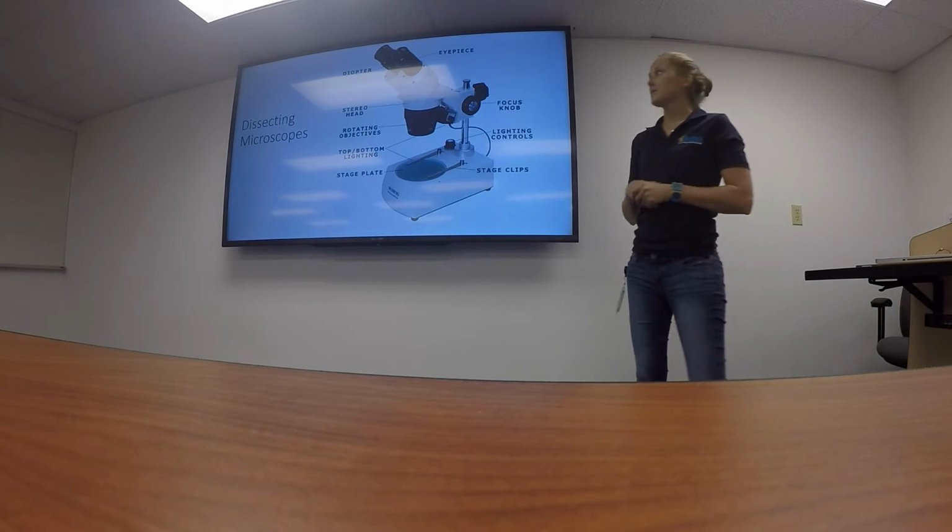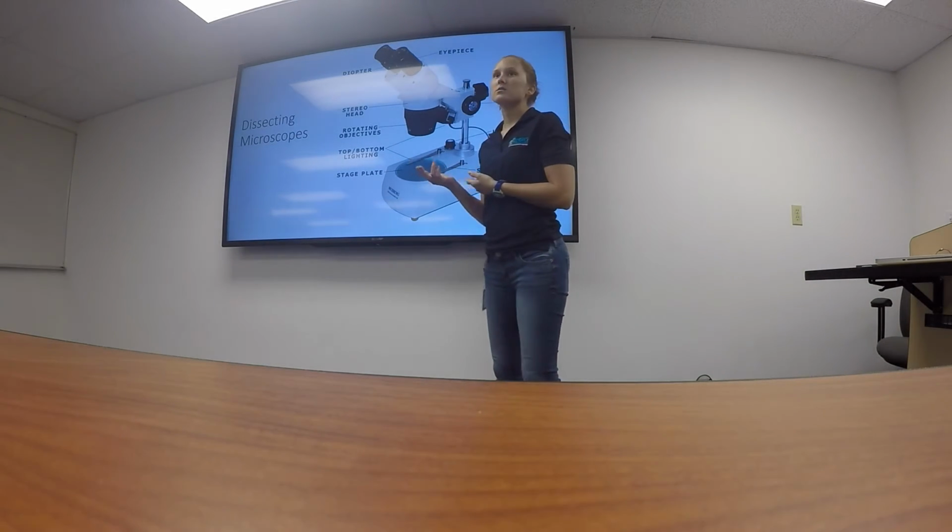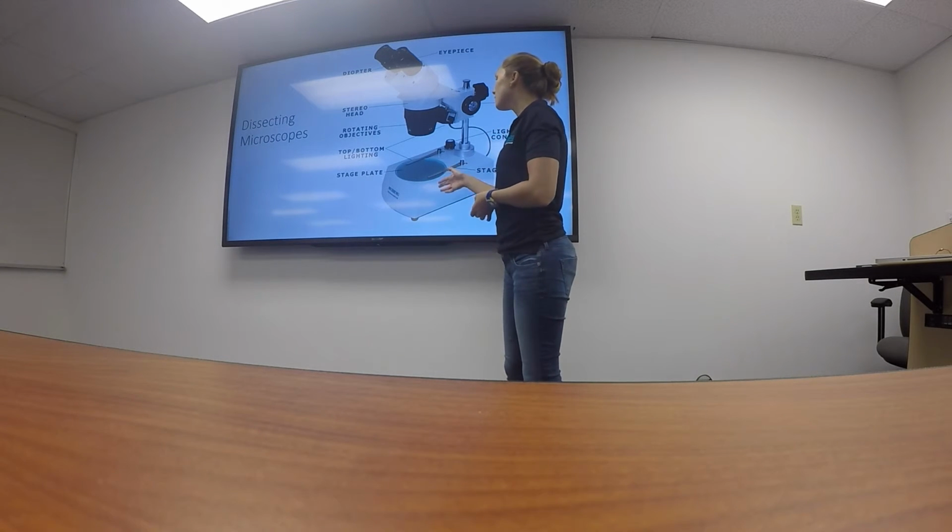And then next we have our dissecting scope. A little bit different, though some parts are still there. This is for larger things you might want to look at under the microscope.